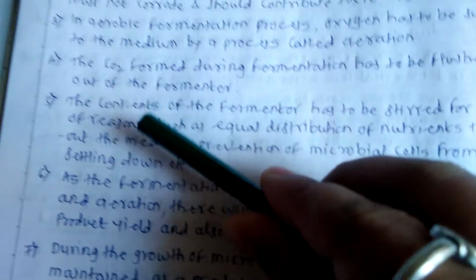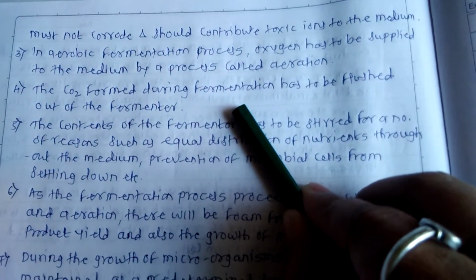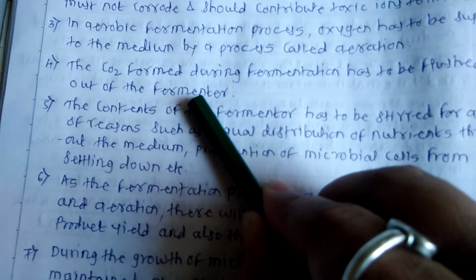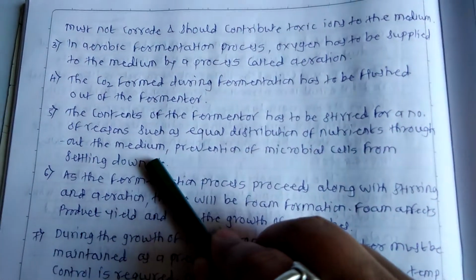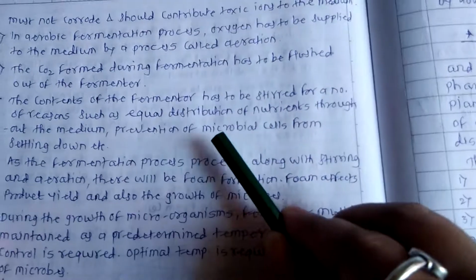The next property is that the carbon dioxide produced in the fermentation process must be removed from the fermenter. Again, there is a provision for this. Next, the fermenter works in such a way that there is stirring of the media.